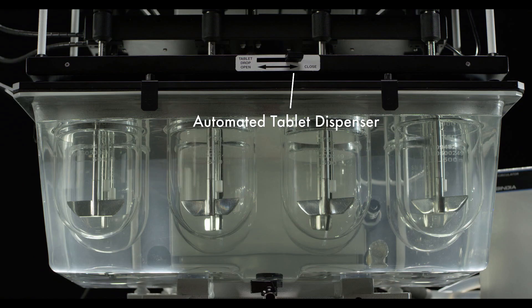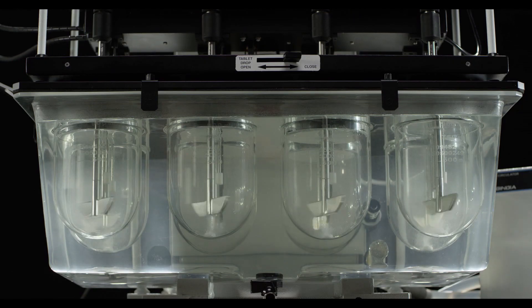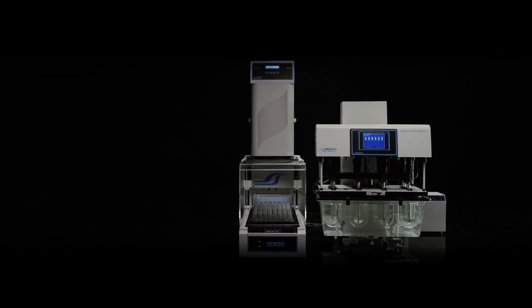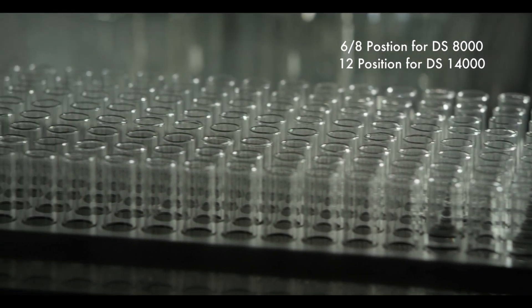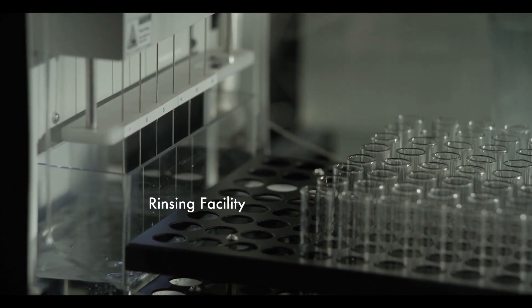The automated tablet dispenser drops the dosage form at a single instance. The sampling assembly is withdrawn immediately after recording the temperature. An auto-recognition sensor for the tray provides an alarm facility for collection of sample. The entire sampling path is rinsed in between sampling time points.